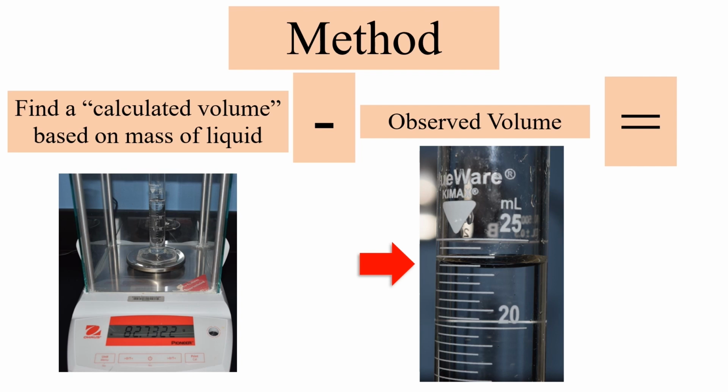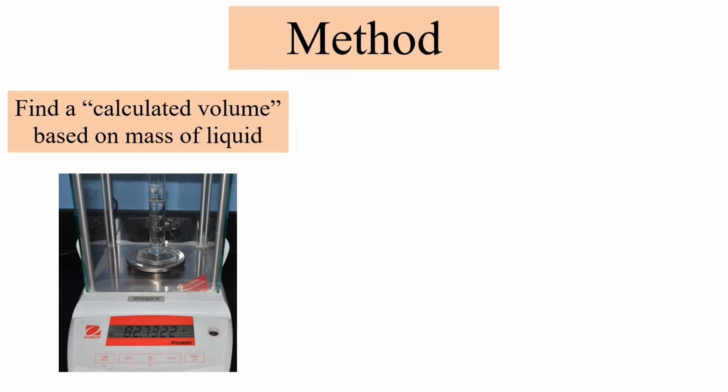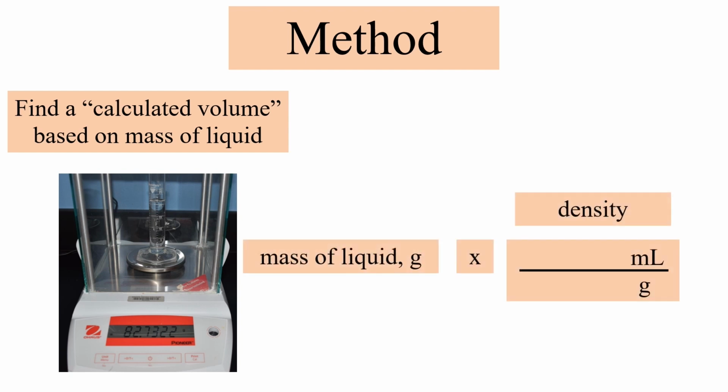And the question you should be asking is, how can we compare a mass and a volume? This is how we do it. To find the calculated volume, we'll measure the mass of the liquid and then use the density to convert to the volume.